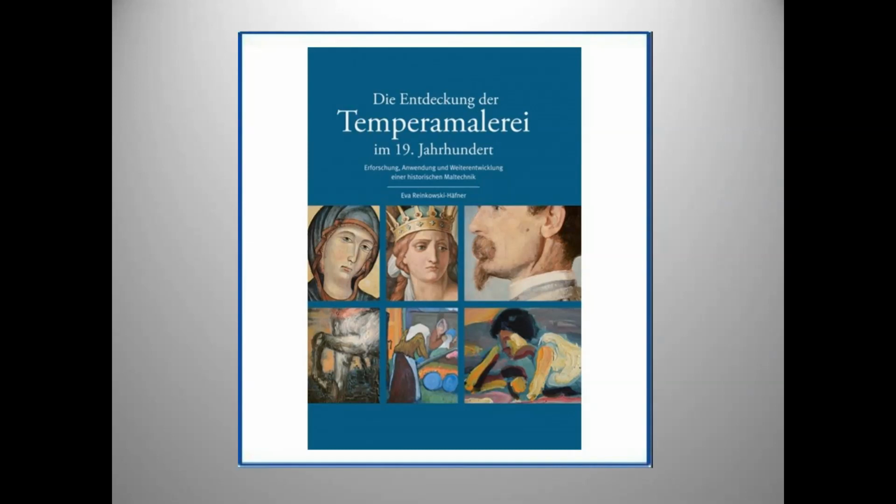became possible. The chapter GCMS in the characterization of protein paint binders in the book Organic Mass Spectrometry in Art and Archaeology by Colombini and Mondugno gives an overview of the types of proteinaceous substances found in artwork, including casein, parchment glue, and egg tempera. Information is provided on interfering factors which may influence the characteristics of the amino acids and thus the interpretation of the analyses, such as natural aging reactions, including denaturation of the proteins, and the interaction of proteins with metal cations within the paper. Commonly applied sampling methodologies are briefly described, as is the pre-treatment of samples and data interpretation.